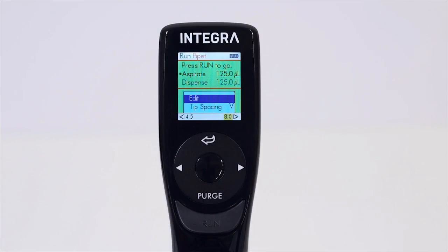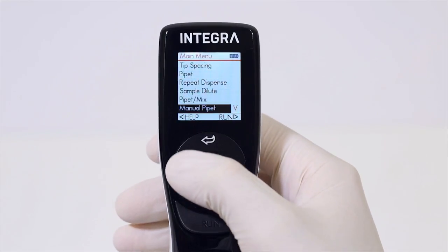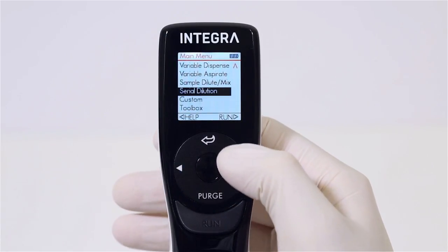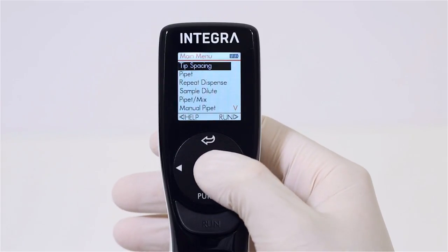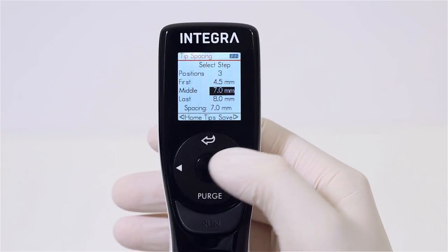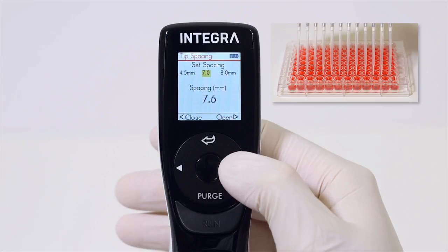A color screen and proven touch wheel interface offer quick and comprehensive menu navigation. Simply by running your thumb around the touch wheel, you can quickly select from a broad range of pipetting protocols. The Voyager lets you save up to three tip positions, and each of them can be adjusted to any required distance.